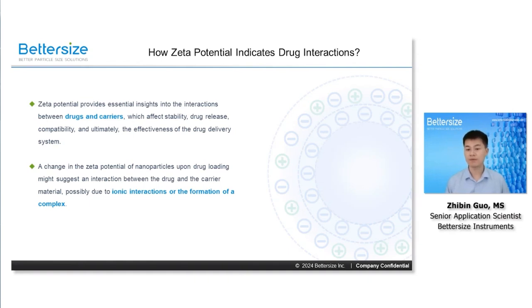For many biopharmaceutical examples, a notable change in the zeta potential of nanoparticles upon drug loading often suggests an interaction between the drug and the carrier material. This interaction may result from ionic interactions or the formation of a complex between the drug and the carrier. Understanding these changes is essential for optimizing drug formulations and ensuring that the delivery system functions as intended.